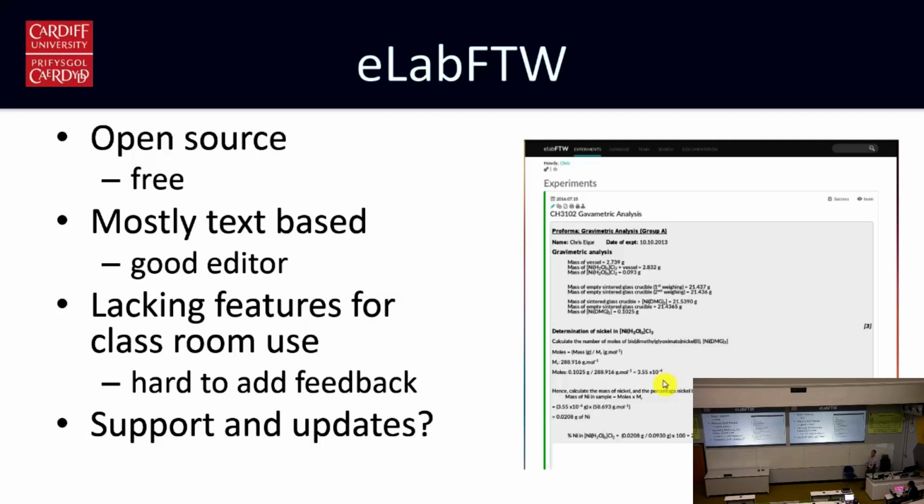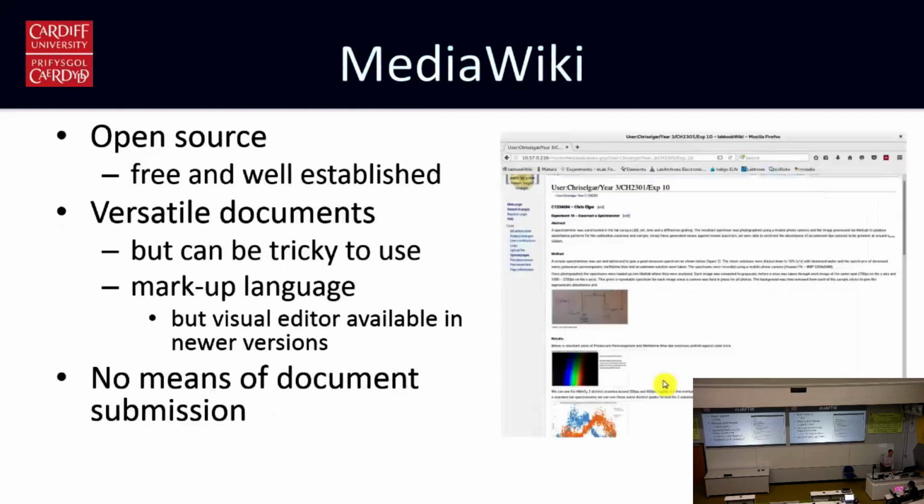eLab FTW is another open source solution. It's free. When we evaluated it, it was mostly text-based. There's quite a nice text editor, but it rather lacked features for classroom use, so it's rather difficult to add feedback. There doesn't seem to be much of a user community at the moment surrounding this notebook, so we were a little bit concerned about whether support and updates would be available in the future.